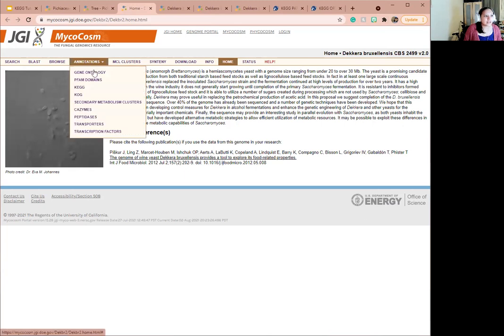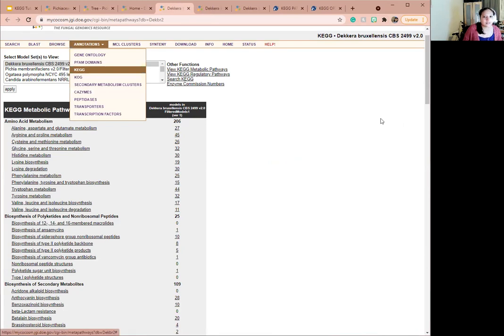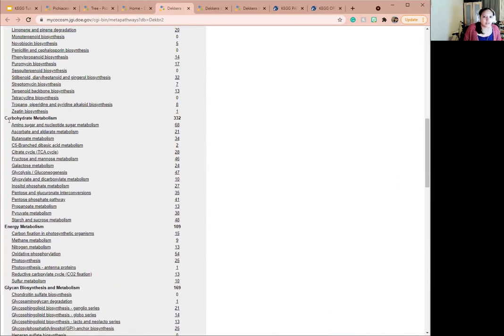And from here, we will click on annotations and go to KEGG. And this will take us to the KEGG browser, which displays the metabolic pathways and associated genes for Dekkera. And genome annotations, because there are quite a few others you could click on, in short, describe the function of a gene or a stretch of DNA sequence. In our specific circumstance, we are looking for the metabolism of certain sugars. So we're going to scroll down to carbohydrate metabolism and carbohydrate is just another word for sugars.